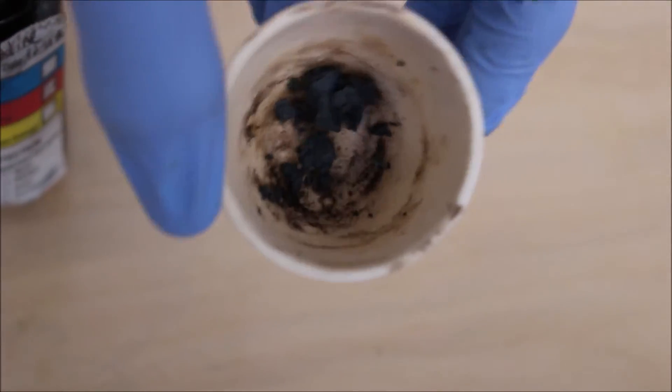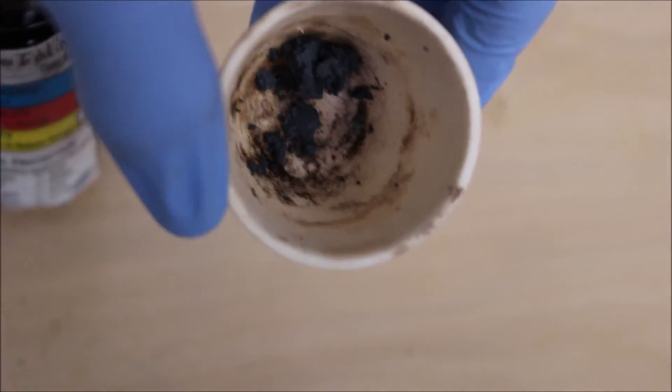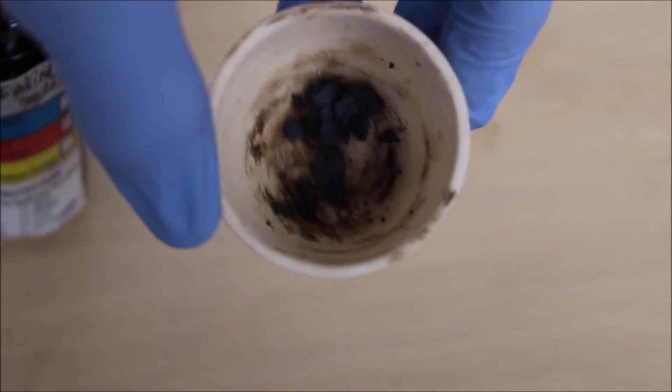So now the iodine is in the crucible, and we're going to start by preheating it, and then we'll just add the sodium in. Okay, now let's remove a small sample of sodium metal.